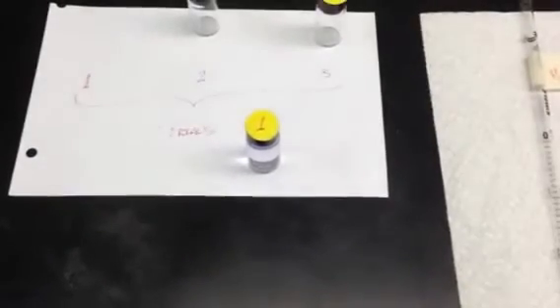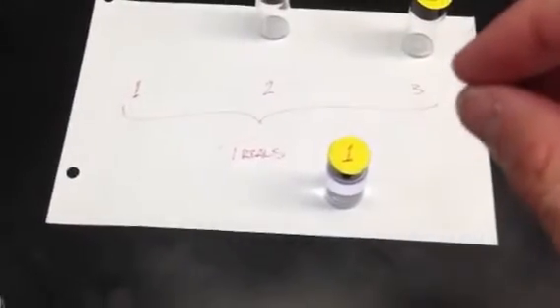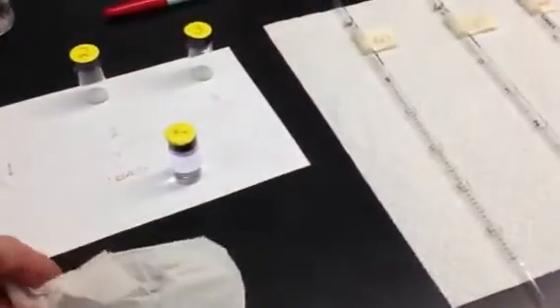I just ran trial one — it was difficult to hold the camera and run this at the same time. I put in the water and the sodium hydroxide, then added the crystal violet quickly. You can see it's still a little bit purple — it was much more purple before. Invert it a couple of times, then wipe it down with a KimWipe because you don't want any fingerprints on it. Put it into the colorimeter, close the lid, and press the play button.